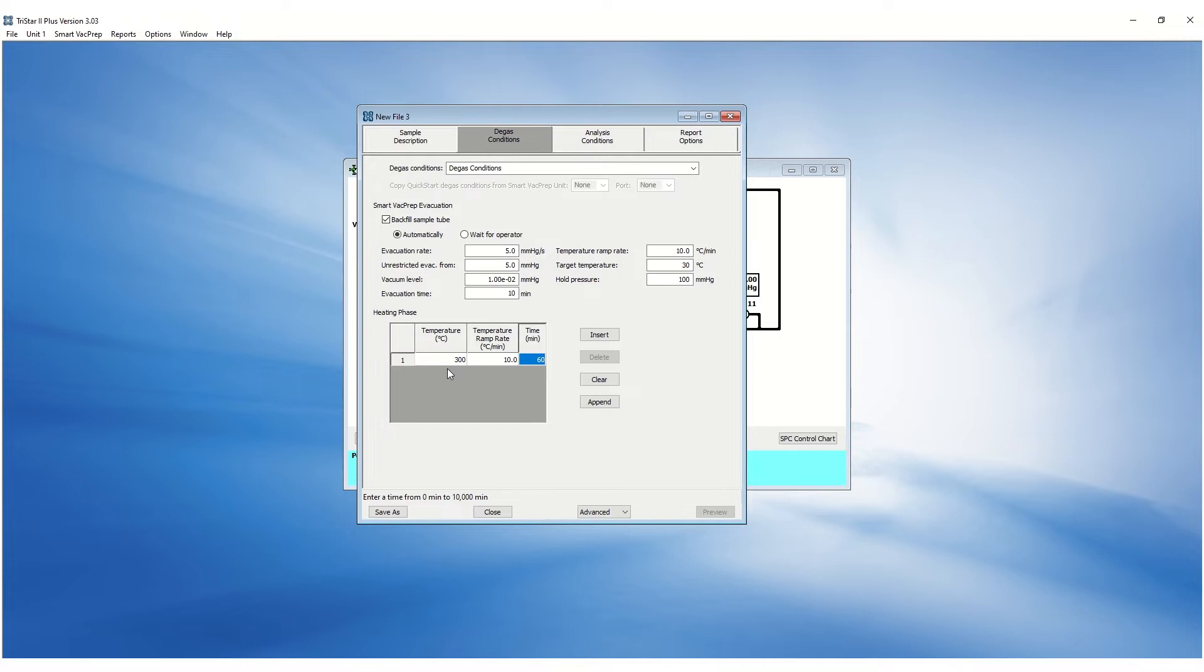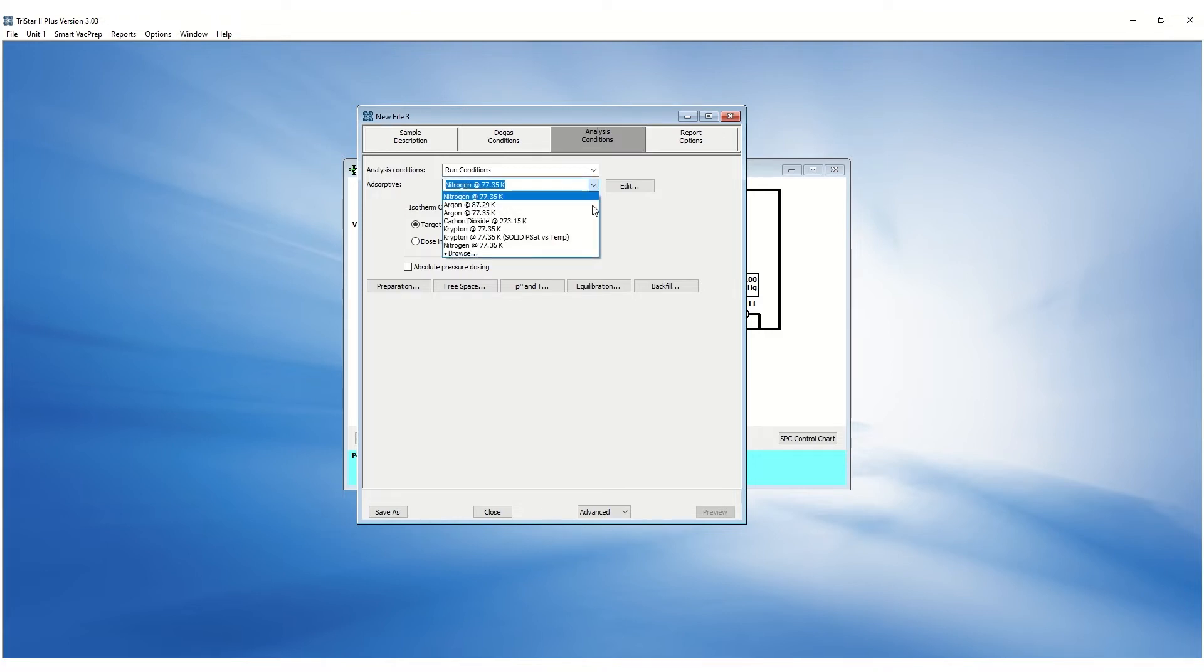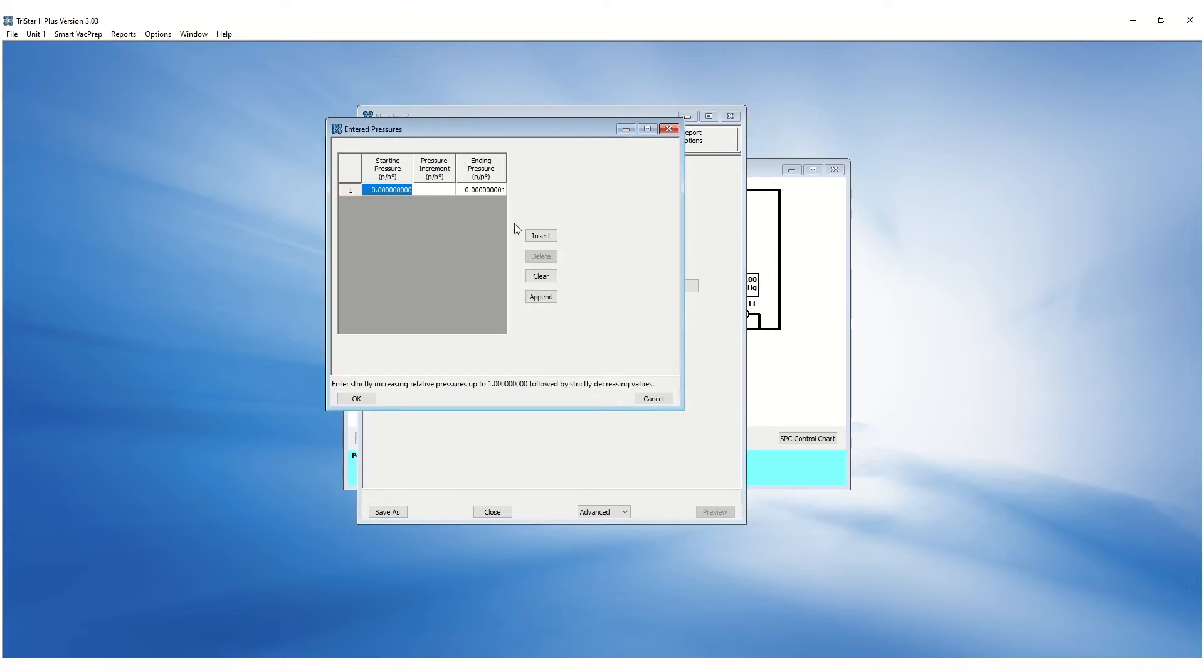The analysis conditions are parameters the Tristar will use to collect data. The adsorptive can be selected in the adsorptive drop-down box. Data can be collected by entering each relative pressure point or using the pressure increment option.